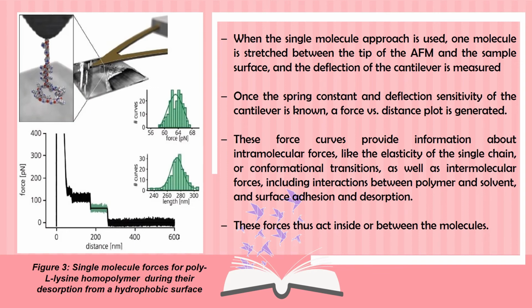These force curves provide information about intramolecular forces like the elasticity of the single chain or conformational transition, as well as intermolecular forces including interactions between polymer and solvent, and surface adhesion and desorption. These forces thus act inside or between the molecules.